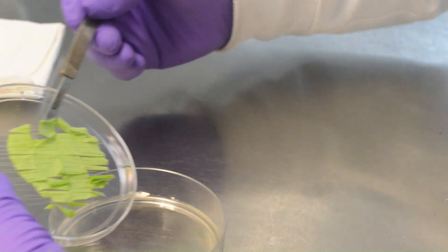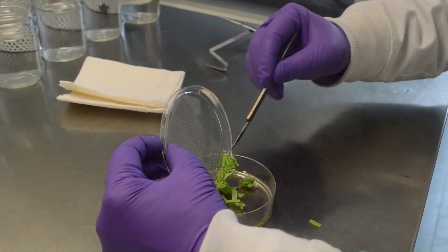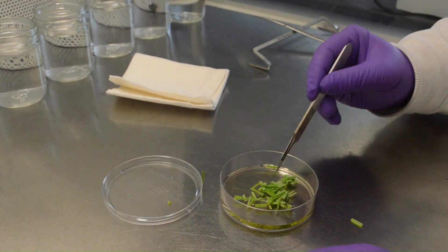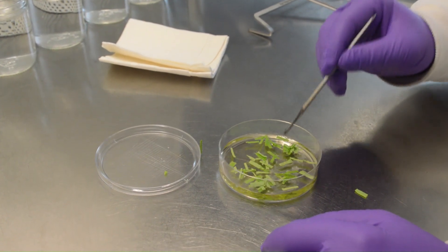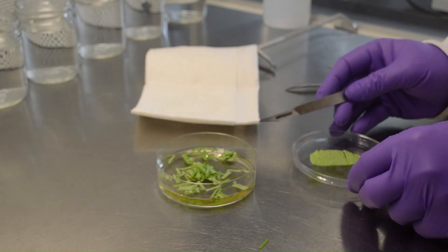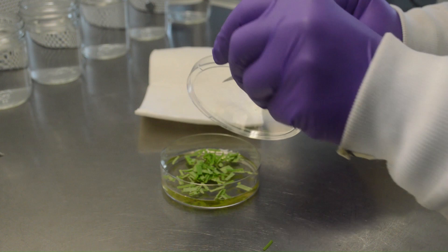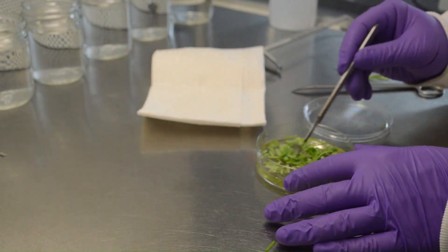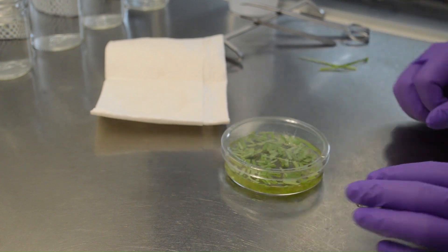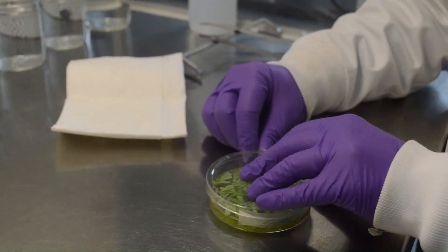Transfer the rectangular pieces of leaves to the digestion media. Do not overcrowd the digestion media with the leaves. Spread the leaf strips to make a single layer. Seal the plate with parafilm and wrap the plate with tin foil.